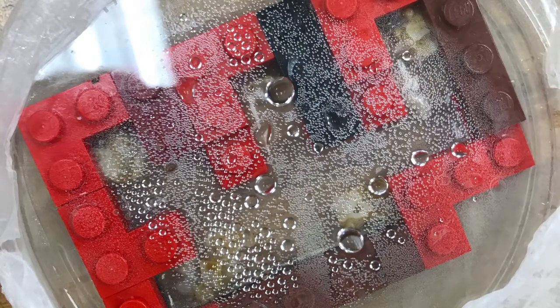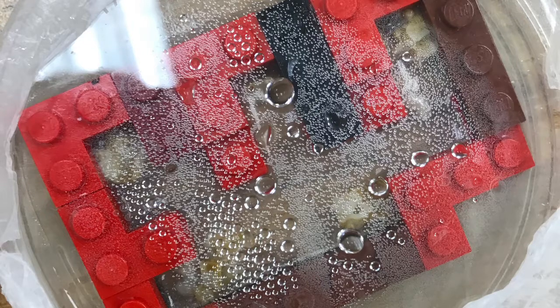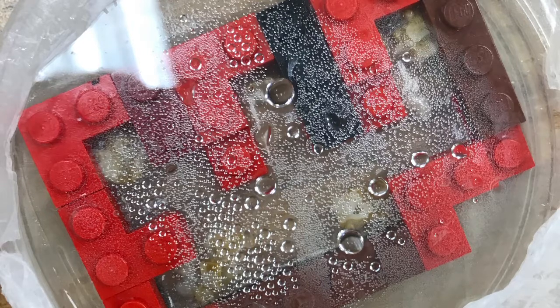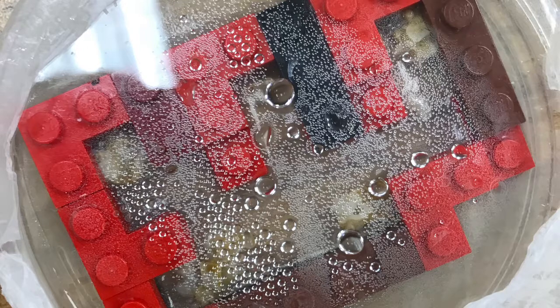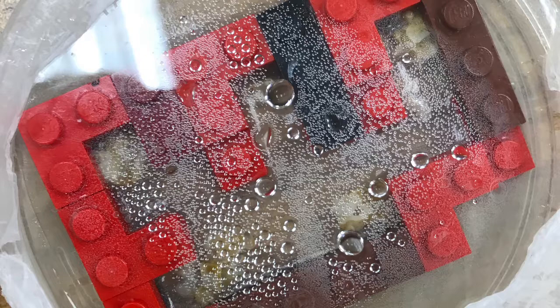In conclusion, our hypothesis was not supported. The mold was not able to grow. However, while the acid and base did not lead to the growth of the slime mold, they did act differently than the control, with a stiff white mold growing on the acidic oat.